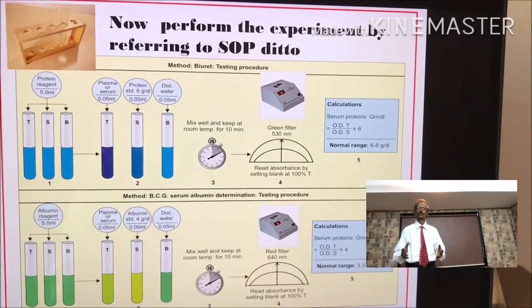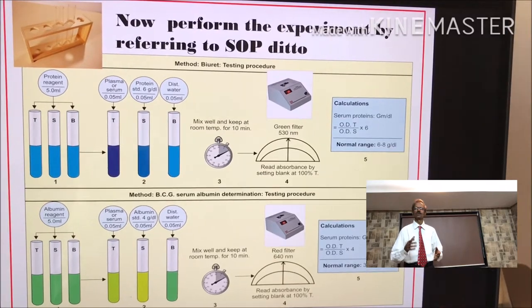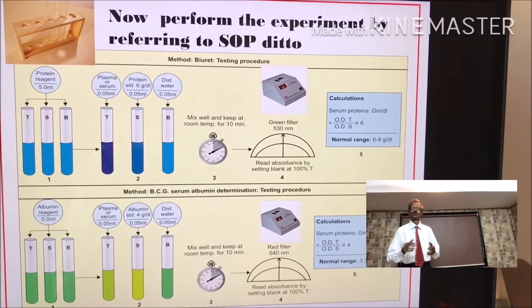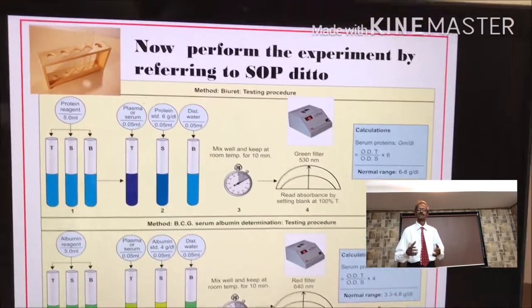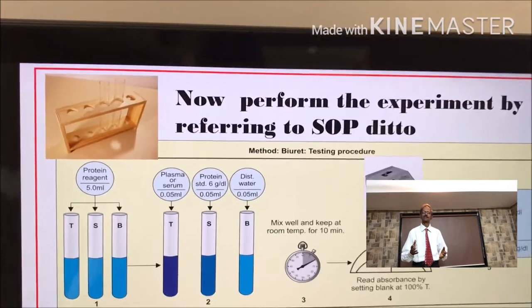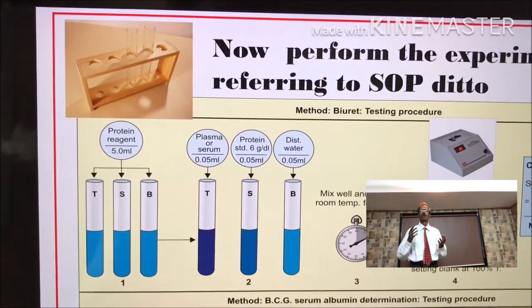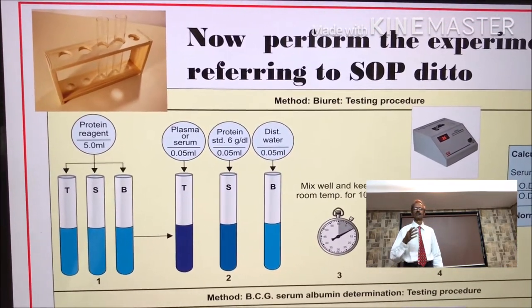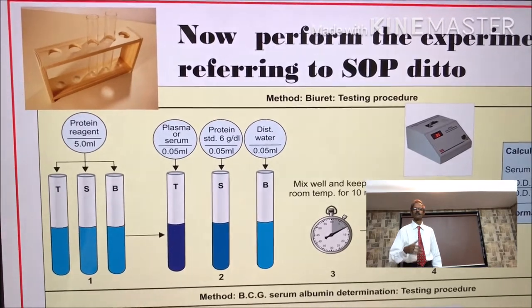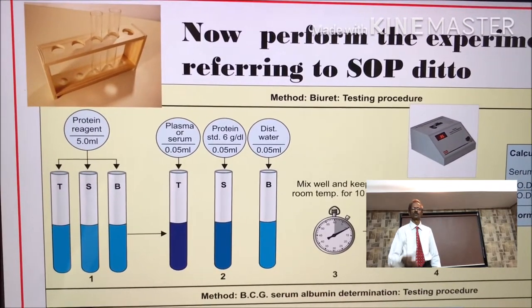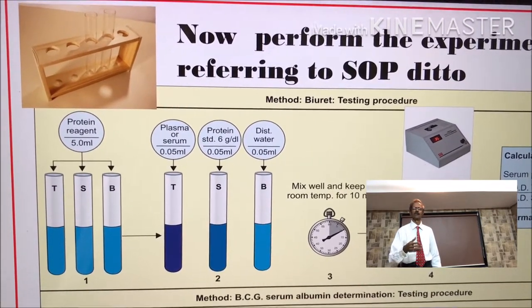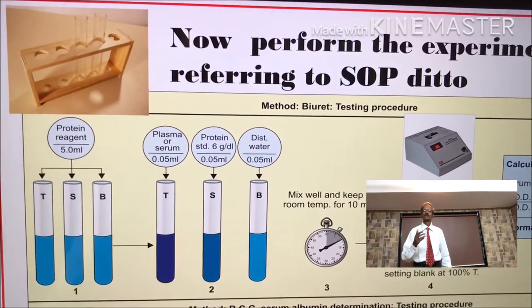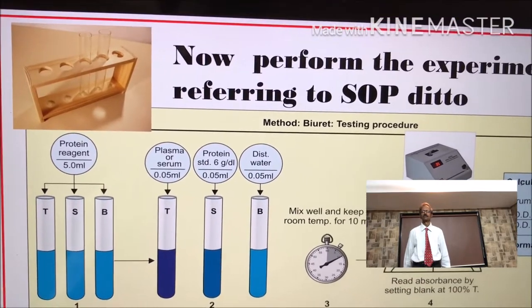Perform the experiment by referring to the SOP. First, take a test tube stand and place 3 test tubes and label them as T for test, S for standard, and B for blank.